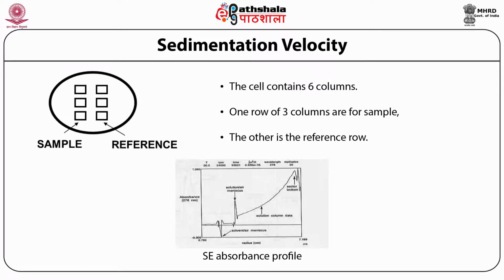In the sedimentation equilibrium experiment, the reference column is fixed with more than one sample column. The sample concentrations are usually varied at 0.25, 0.5 and 0.8 optical density at 280 nanometers, or the same fraction of absorbance at any selected wavelength monitored by the analytical ultracentrifuge.